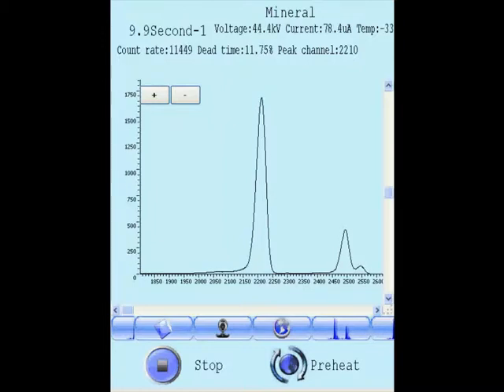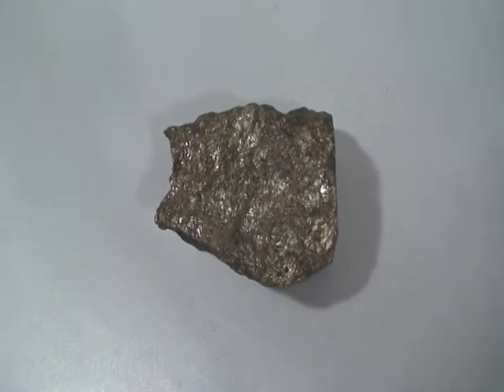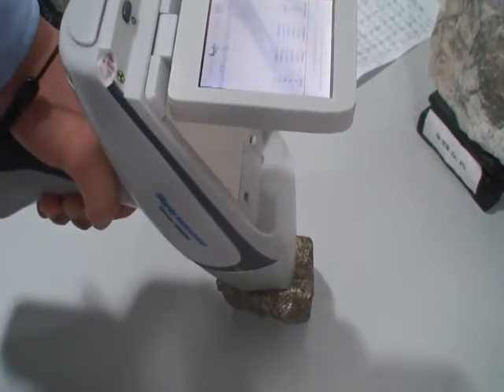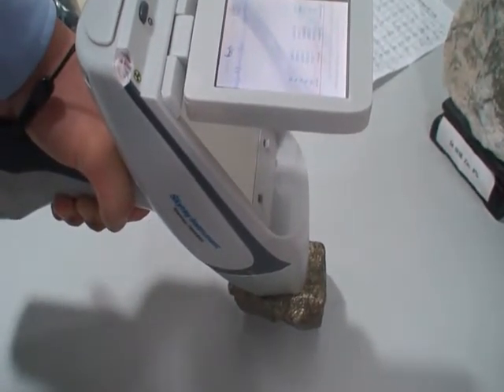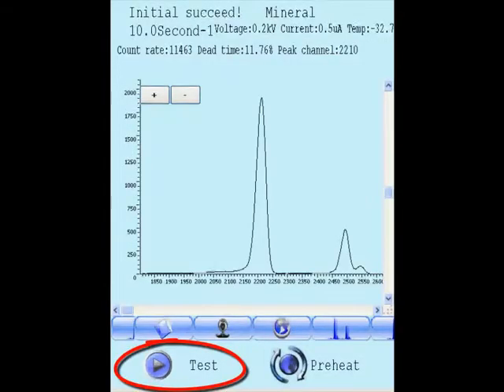Press the button to start the test and point the instrument at the surface of the sample until the test is finished. Click Test to start measuring. Point the instrument at the surface of the sample, click Test, then enter the sample name and other information and press OK.